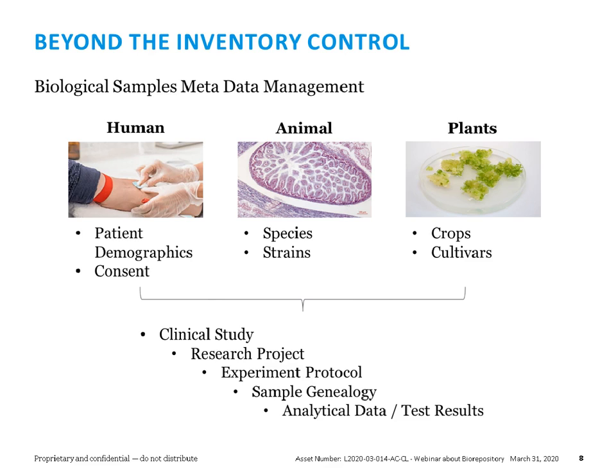But also we have needs for keeping these biological samples for animals. And there are many cases where laboratories also carry out clinical studies with animal samples. So this is very common in preclinical trials. So it is also important to understand that we have to support different classifications, and in the case of animals, a species is not enough. We have to also maintain and manage a hierarchical classification of the strains for the different species.